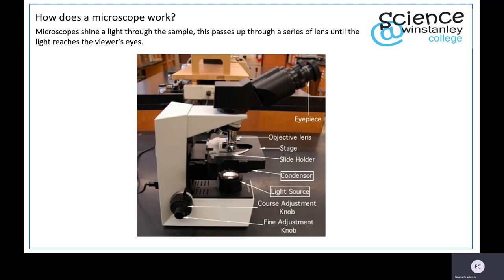The light source shines through a condenser, which can be used to control the amount of light passing through your sample. If it's bleached and you can't see anything but bright white light, you can close it and let less light through. If it's too dark you can open it to let more light through.